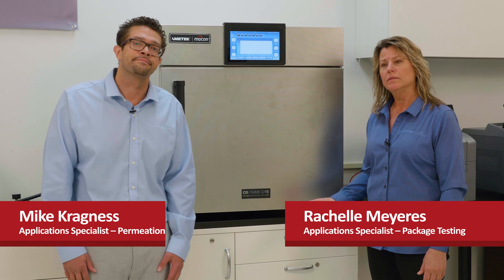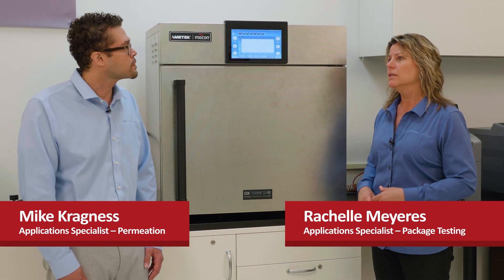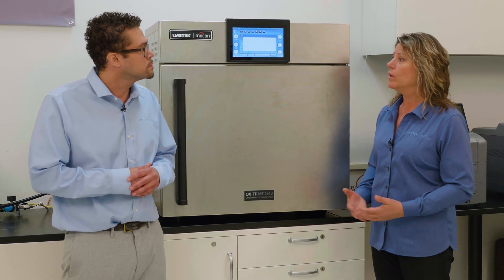Hi, I'm Rochelle and this is Michael. So Michael, before we begin, let's talk a little bit about permeation. What is permeation?